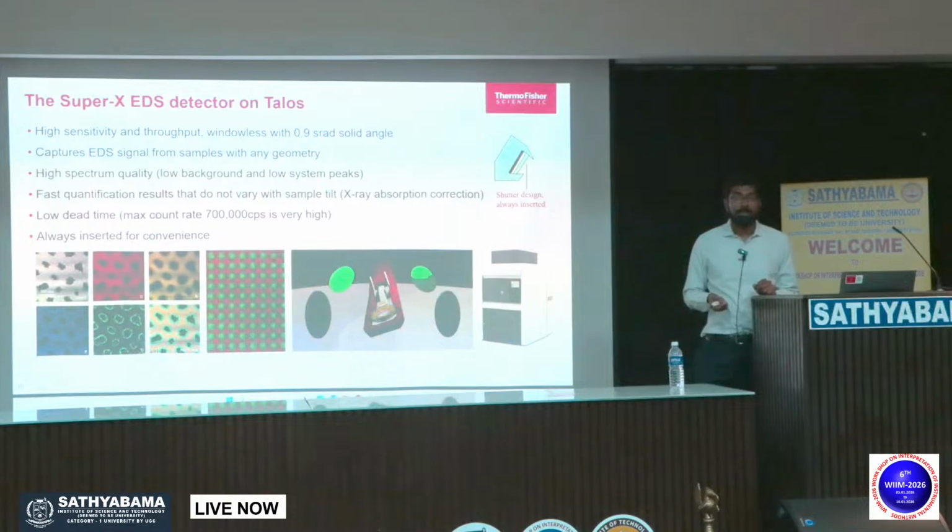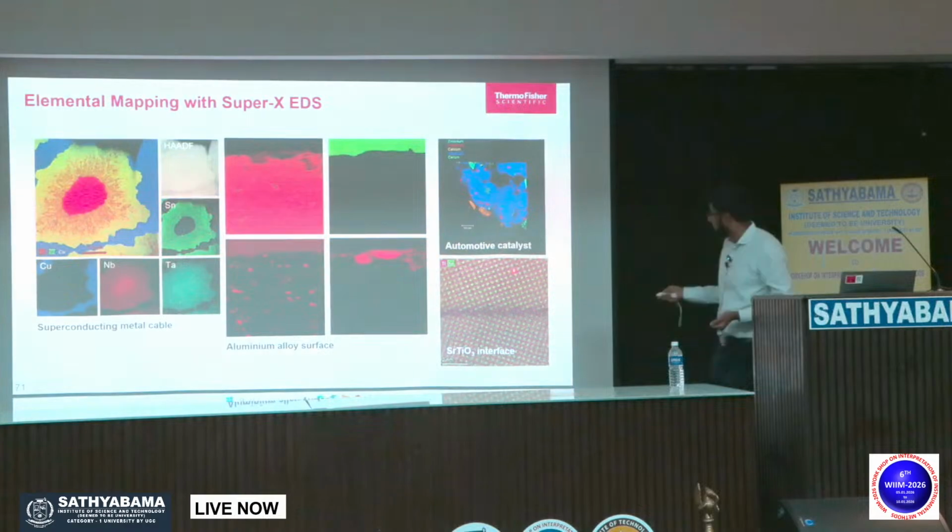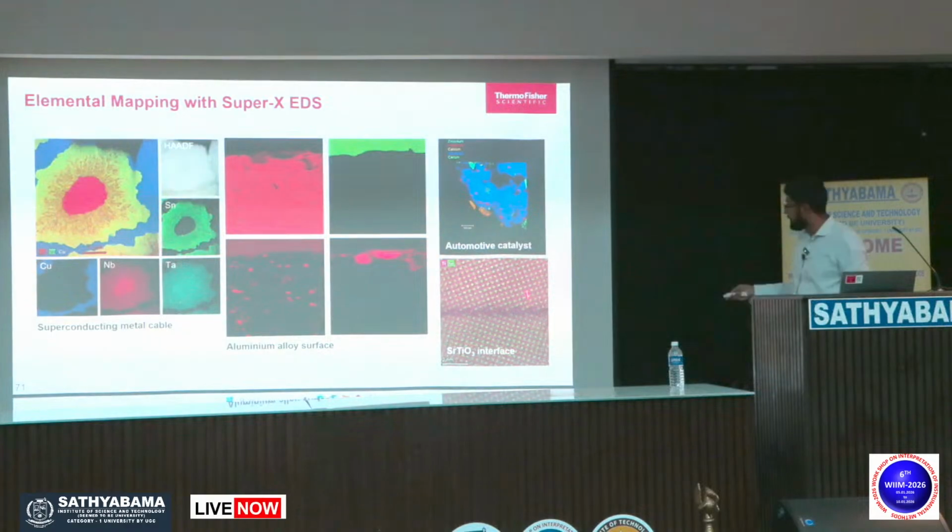For example, I can give one example. Let's say how the elements are distributed across your samples, and then you can also look at a small specific region. You can also have an atomic resolution map of the interface. This is, I would say, a qualitative way. I cannot rely on quantification of this HRTEM image, the HR EDS maps.